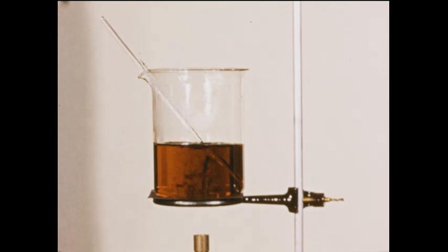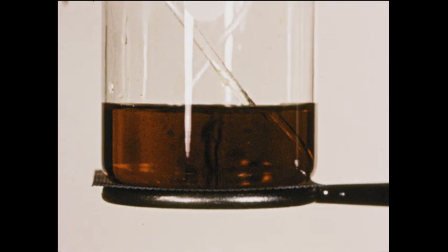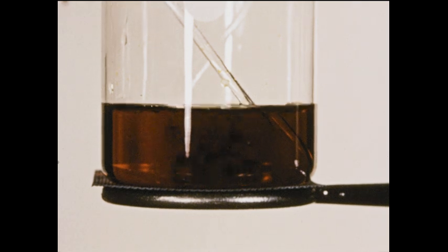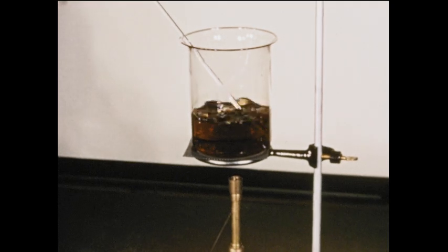The colloidal particles of the same substance have the same electrical charges. In this case, they are the positive charges. Since the positively charged particles repel each other, they stay separated in suspension. However, if we neutralize the positive charges, the particles could become larger than colloidal size and precipitate out. In other words, having made a colloid chemically, we can destroy it chemically.